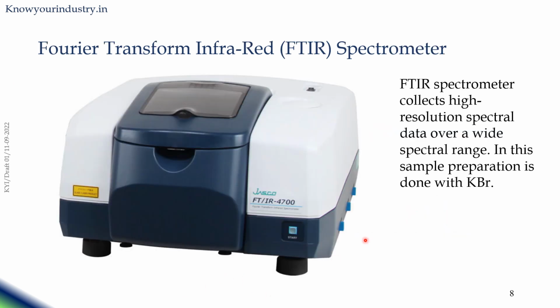In this particular slide, we are seeing the image of a typical infrared spectrophotometer, which is a widely used one. That is called the Fourier transform infrared spectrophotometer, which collects high resolution spectral data over a wide spectral range. In this particular spectrophotometer, we use potassium bromide for the sample preparation.